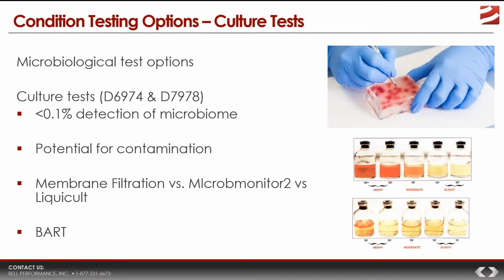So let's say that you start with 8 original microbe cells. You got them in your culture medium. But let's say that in addition to those 8, you have 2 microbe cells that came in from the outside. You had cross-contamination. You now have 2 microbe cells that were not present in your fuel sample, and thus they were not present in your storage tank. So you've got 2 out of 10.